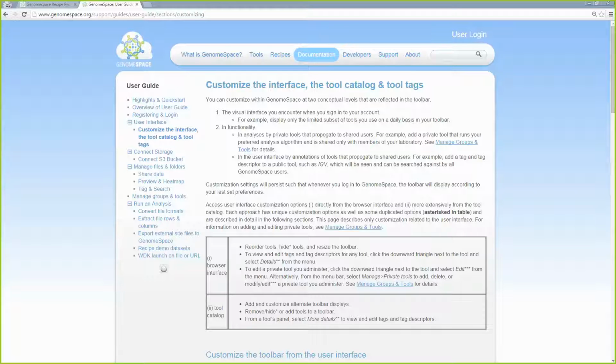Question on which tools can be used for QTL analysis. QTL analysis is not something we have many recipes up yet on. That's something we're really looking to start including more of. I believe Galaxy has some QTL analysis, but I might be misremembering. Again, that's definitely on our horizon, in our playbook, so keep an eye out for that, everyone.